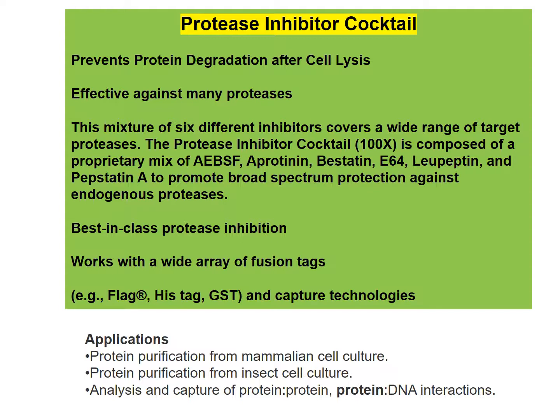There's some tagging in other approaches where you're purifying proteins. We'll talk about protein tags and FLAG and glutathione S-transferase. Those FLAG, His tags, and GST will be coming.